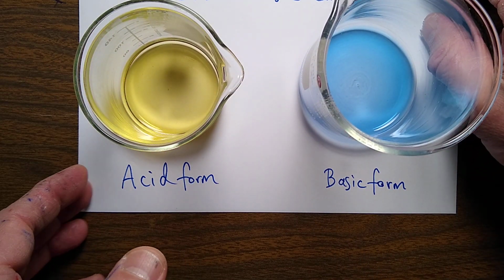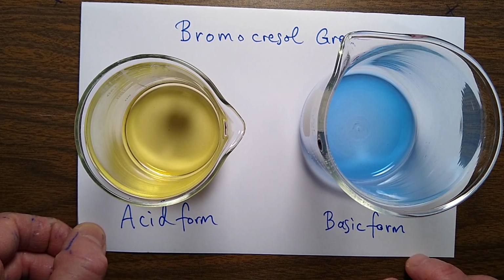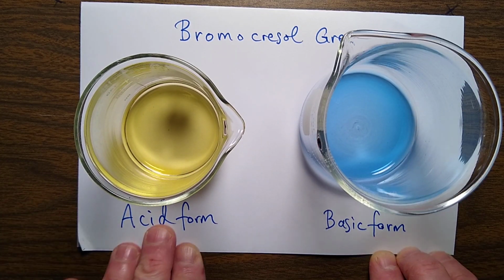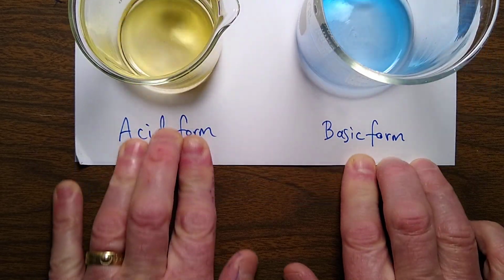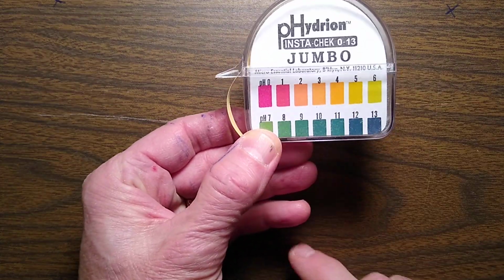It's not an exact estimate of pH. It's just to tell us that the pH is changing. That's a very common color change there. Blue to yellow, yellow to blue. We can also use indicator paper. It turns different colors depending on the pH.